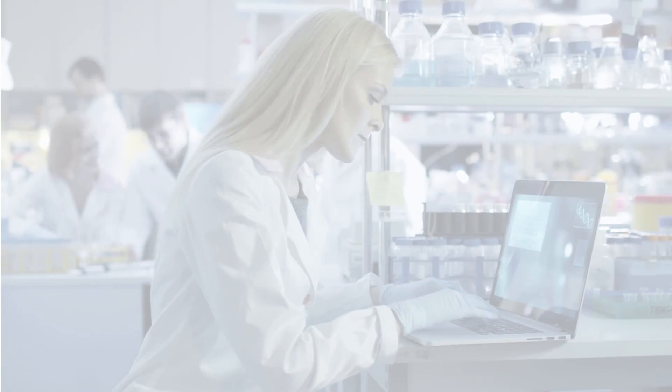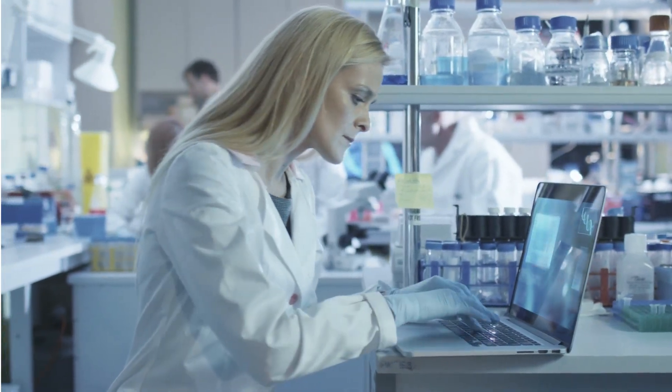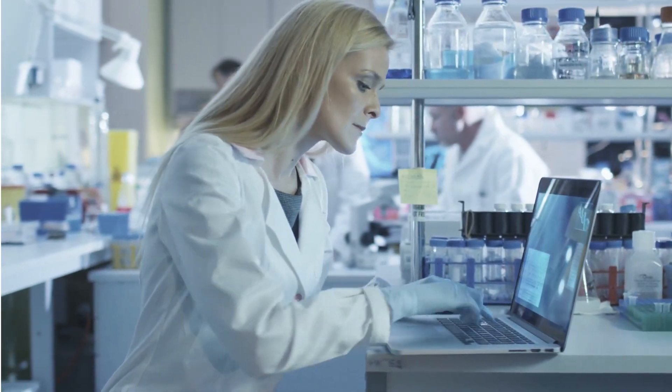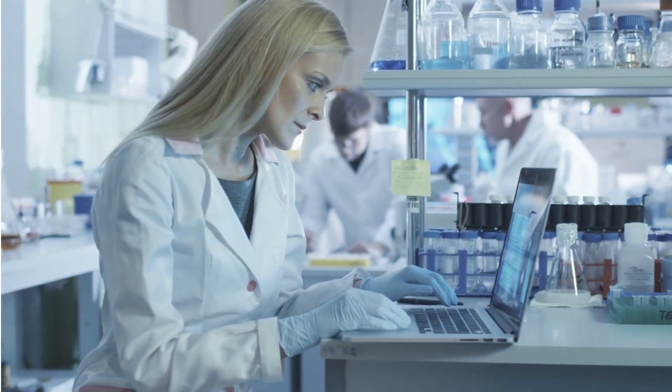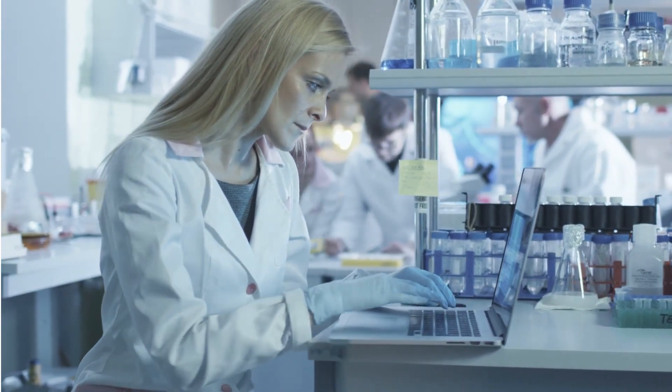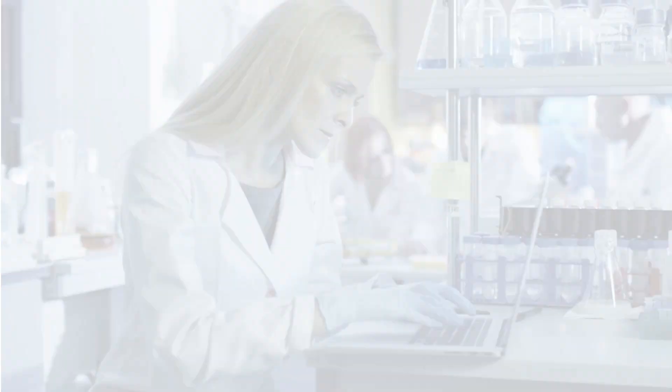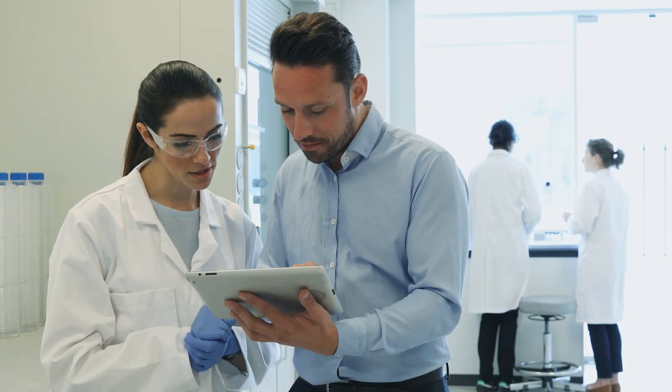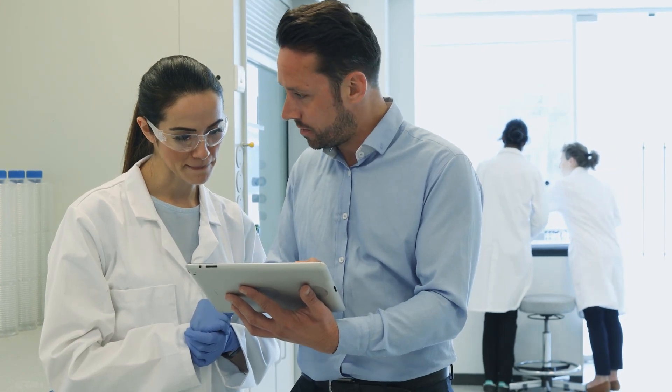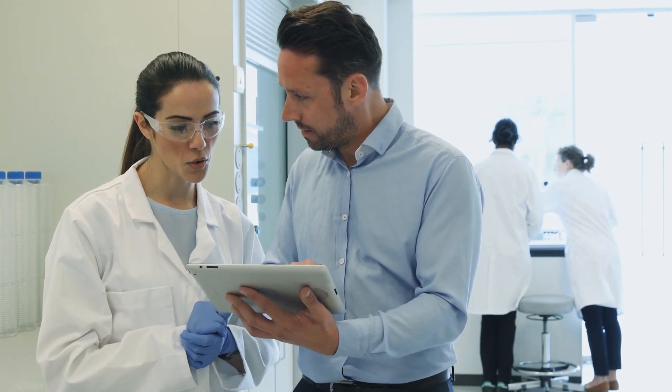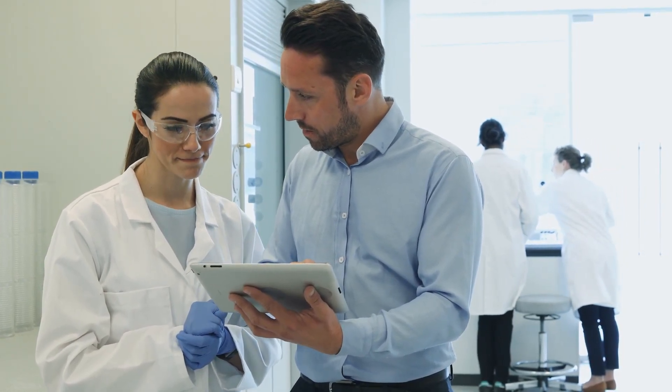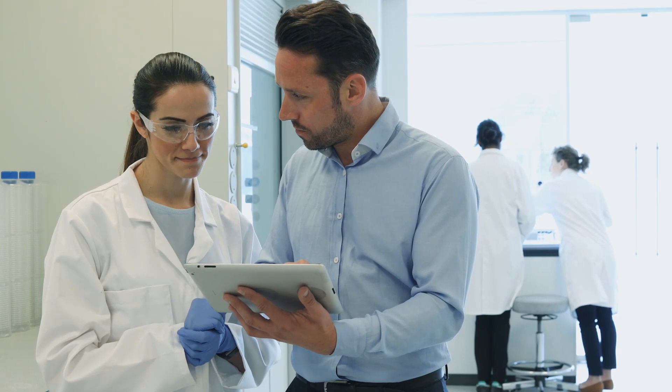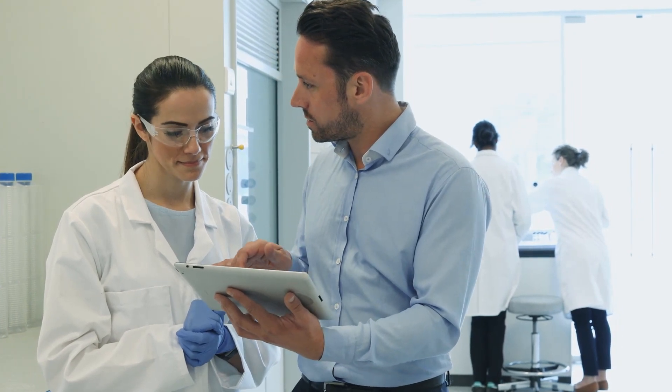Having a central shared system gives every R&D team access to all lead discovery information for any project at any time. This allows for more informed and rapid decision-making at all levels of an organization, for scientists, engineers, technical staff, as well as management.